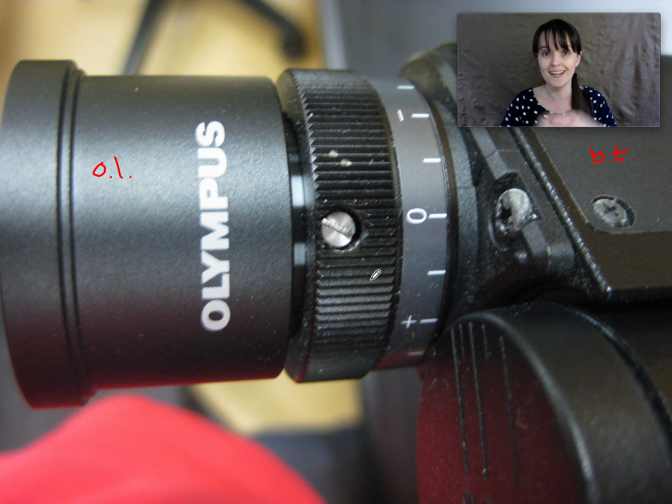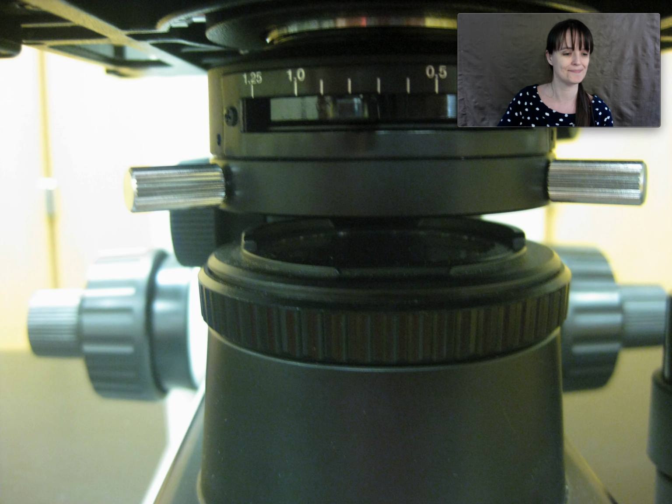So you can focus the left and right eye separately. The right eye doesn't change focus on the ocular lens, so you need to focus the whole microscope on your right eye. And then if the left eye is different, you can rotate this bit on the left ocular lens. So that's how that works.